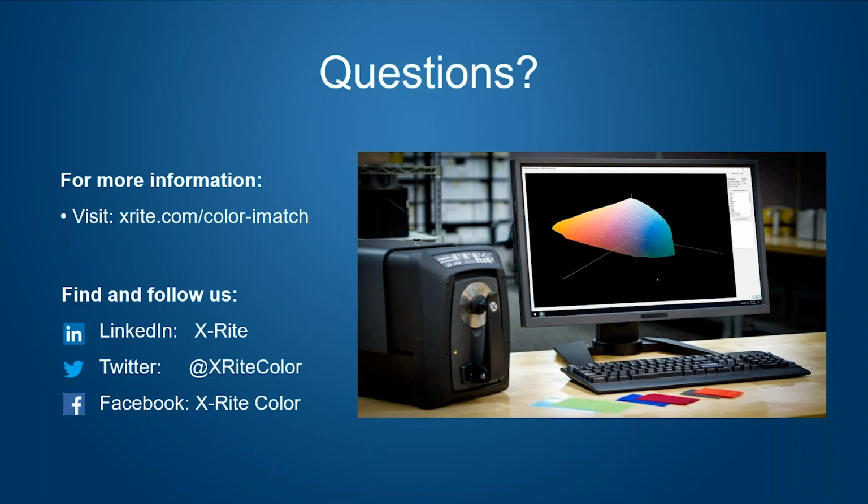So we start with that measurement point. But then within the engine itself, comparing version 10 to version 9, we have additional optimizations that utilize the shape of the curves and the shapes of the colorants to better identify candidate components and incorporate that in our formulation process, as well as new optimization metrics that we've developed that give us more rapid convergence. Tim, do you want to add anything to what I said? No, I think you're right on, Rich.